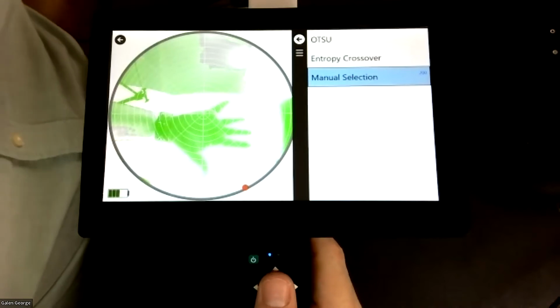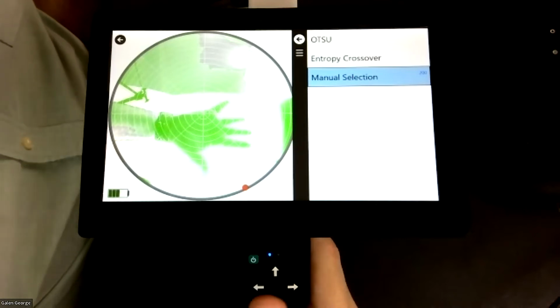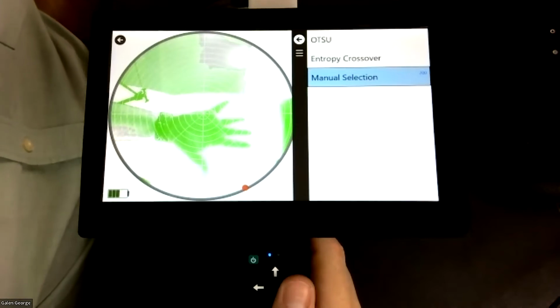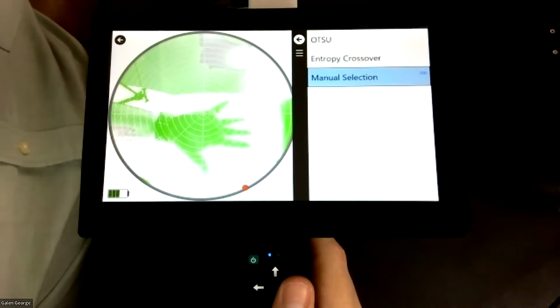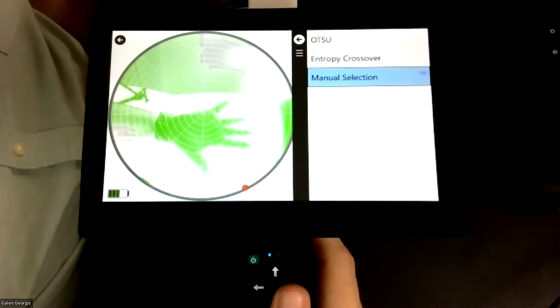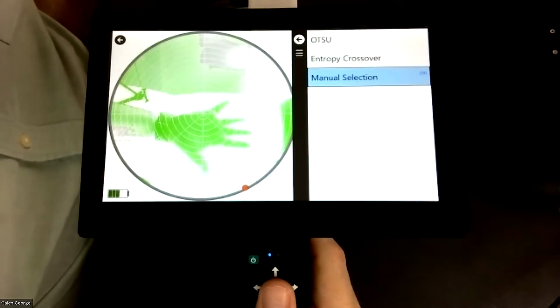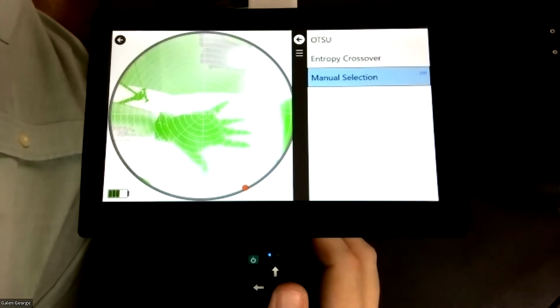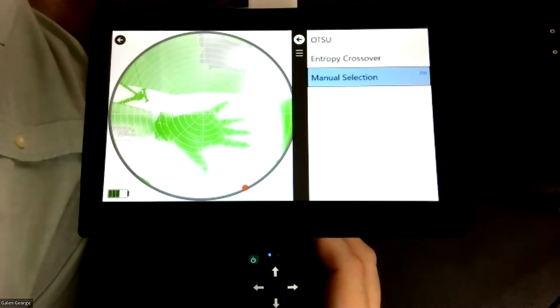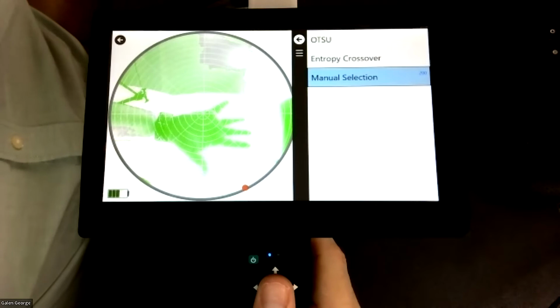A good troubleshooting tip is to go out into your canopy, take an image, and from that image, go through and manually identify what you know for a fact is plant and what is not. You can also use this if you are really trying to narrow down not getting any branches or tree trunks or other non-plant obstructions.